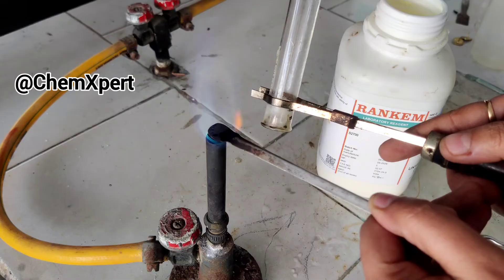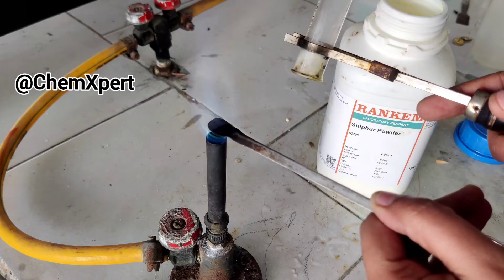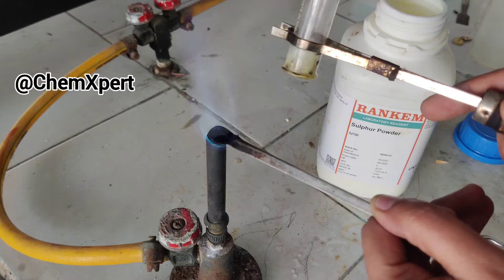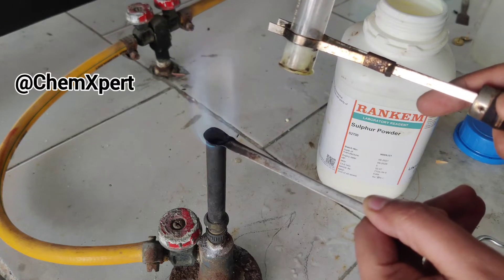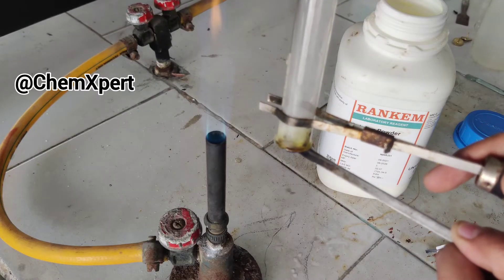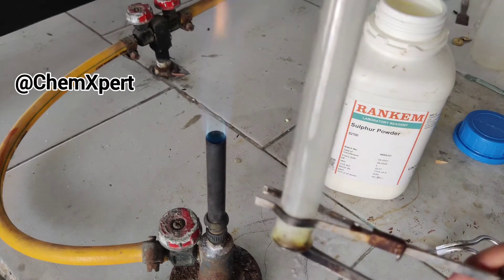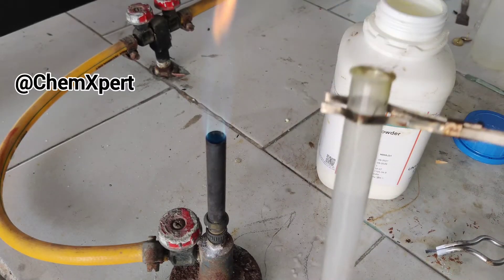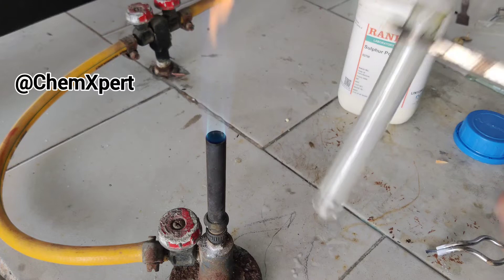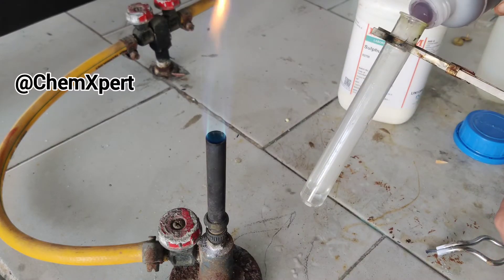The fumes are collected in the test tube. Now I will add water into it and dissolve these fumes. Then we will add blue litmus to this and you can observe the change.